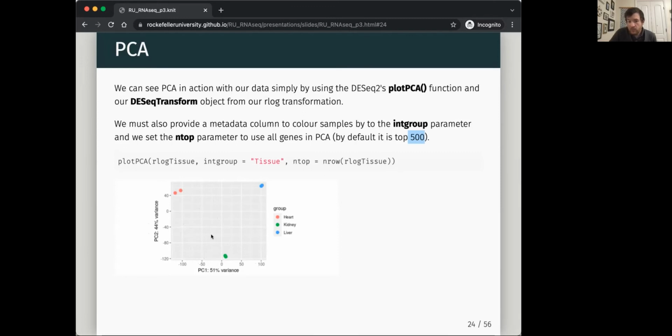So this is actually the majority of the variation that we would care about in this data set: one axis here and one axis here. You can go into deeper PCs like PC3, PC4. Sometimes we dig deep to try and understand other parts of the data if you have a very complex data set. But in this case, it's pretty simple and most of the variation is already accounted for.